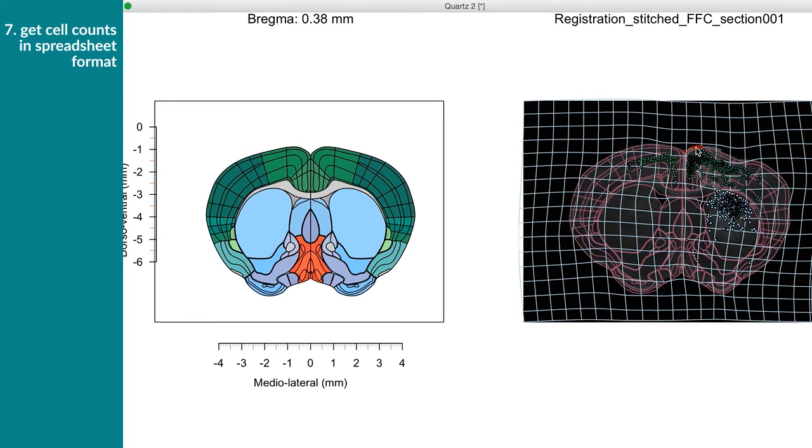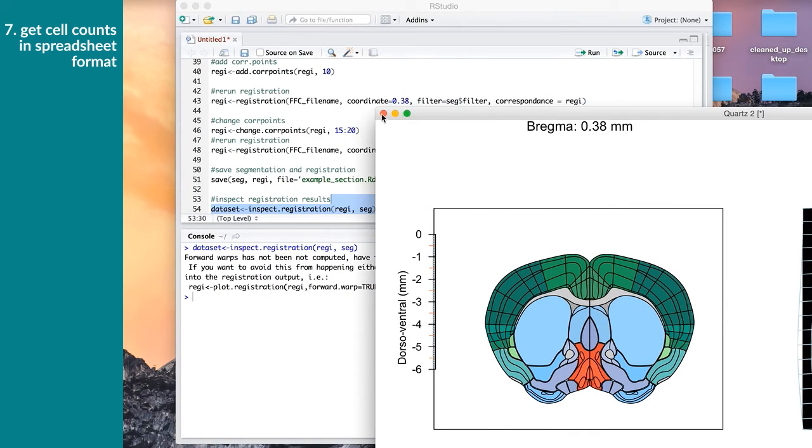And you can also notice here these red ones. These are actually a warning. Like if you have a black cell with a red outline, it means that these neurons have not been properly assigned to any brain region. And if you look closer, these are probably not neurons, but rather something that we didn't intentionally get when we did the segmentation.